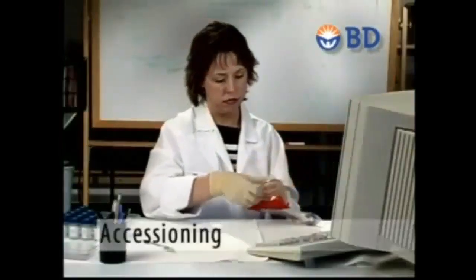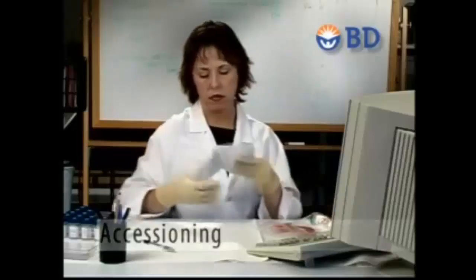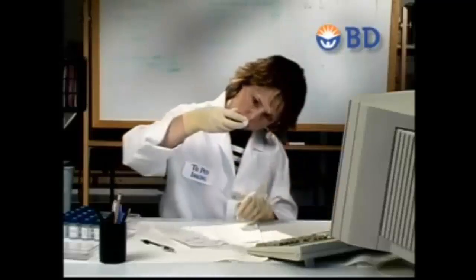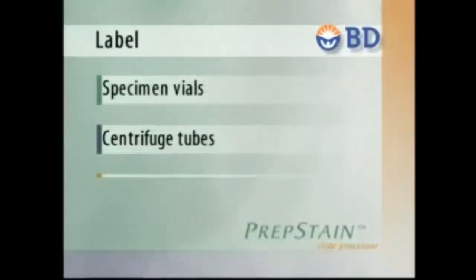Cervical samples collected in SurePath preservation fluid are received from a clinician's office and accessioned according to the laboratory's protocol. Each vial is checked for proper labeling and is visually inspected to ensure it contains the head of the sample collection device. Specimen vials, centrifuge tubes, and glass slides are labeled. Barcode labels are recommended but are optional.